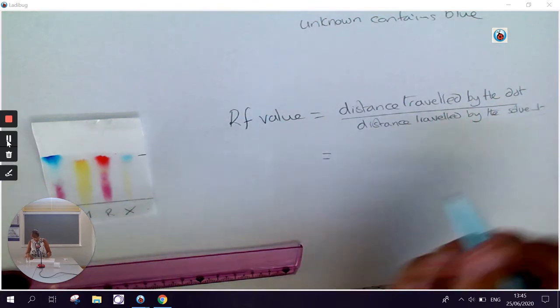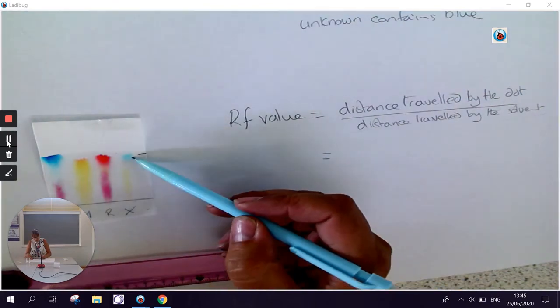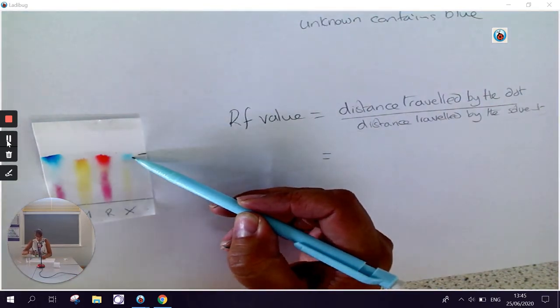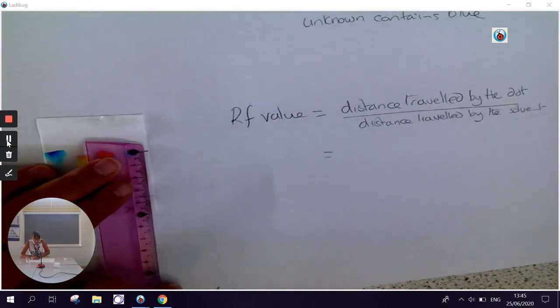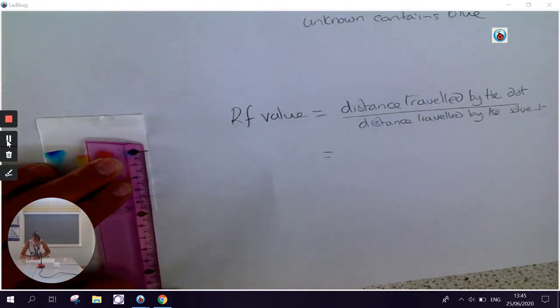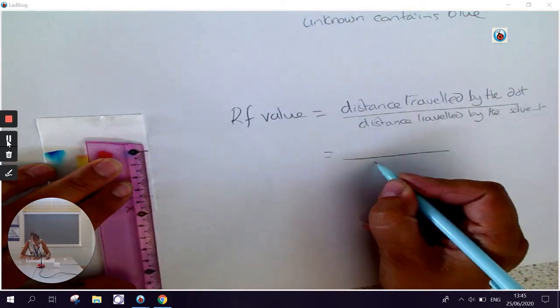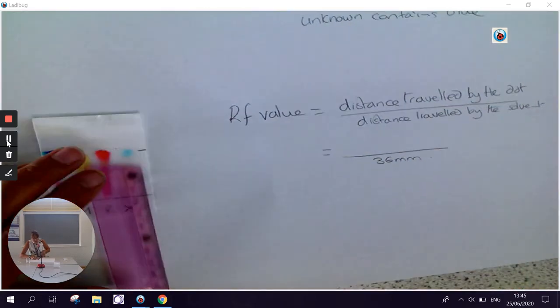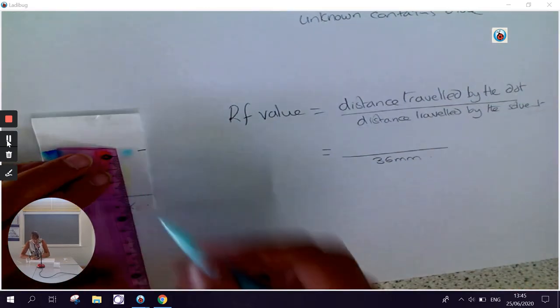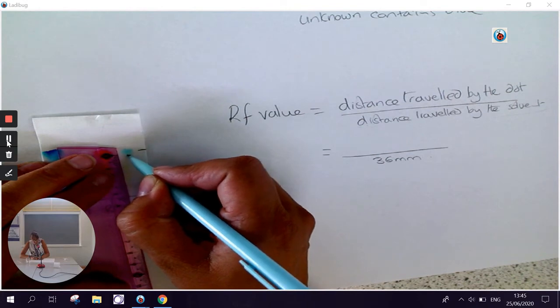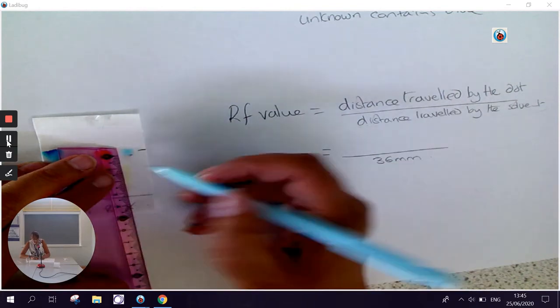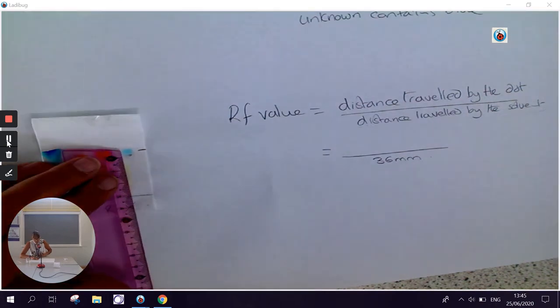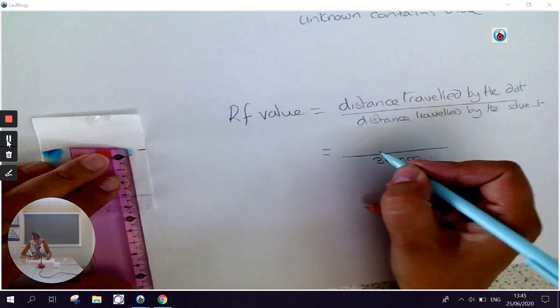I'm going to take this blue dot and work out the RF value of that. So using my ruler, I can see that the solvent front has travelled 36 millimetres. And then I will take the bottom of the dot. And it doesn't matter whether you take the bottom, the middle or the top, as long as whenever you're comparing, you use the same place. And for this one, that has travelled 32 millimetres.